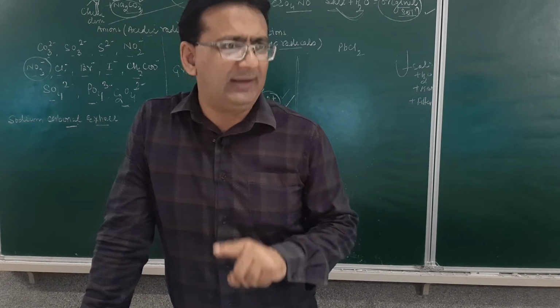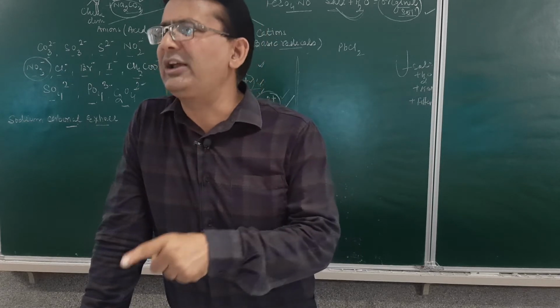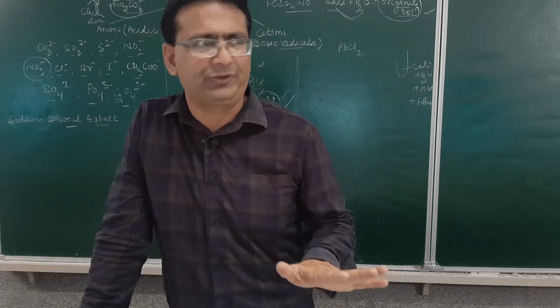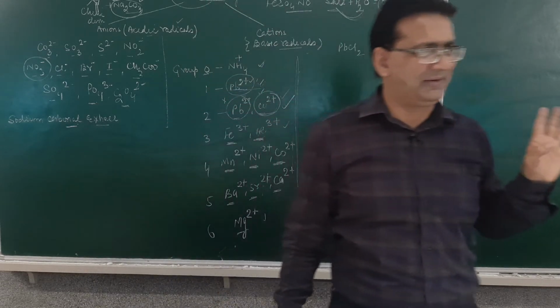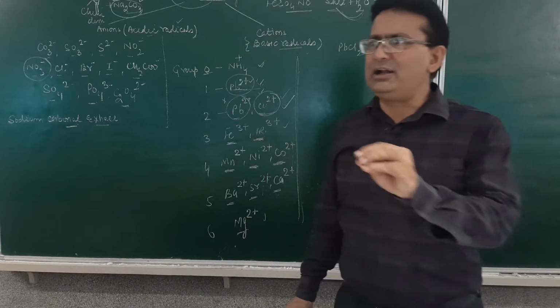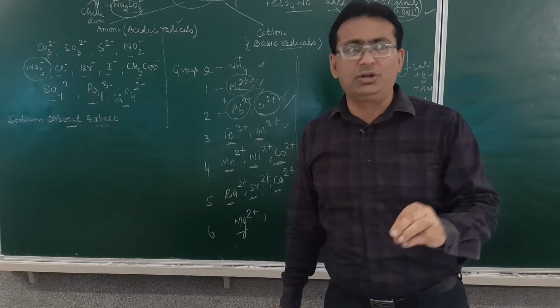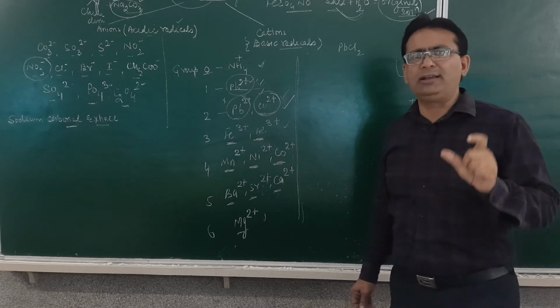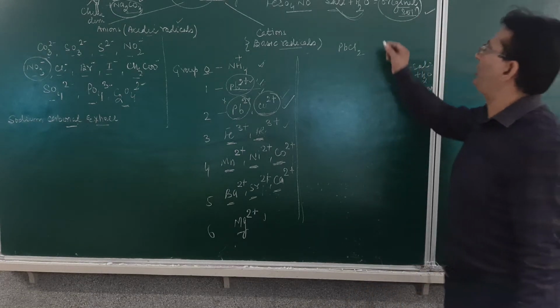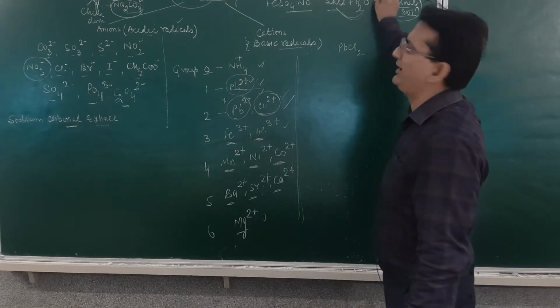But since today is a demonstration day and the first hand experience of yours in this practical for the first time in the lab, we are telling you the name of the salt. You will be identifying these because you know this and will try to learn the procedure today. Main important thing is that you learn the procedure today. So today we have given you the nitrate salt.